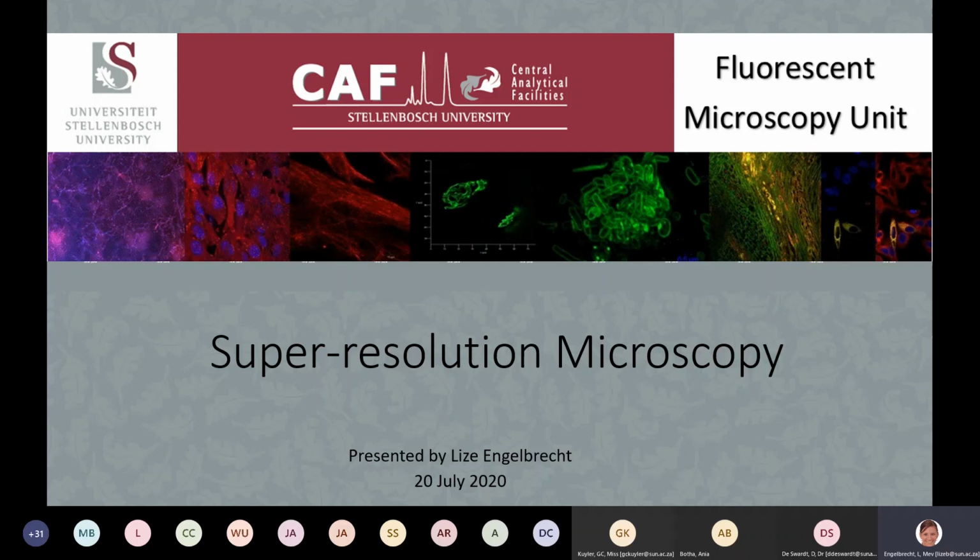But because of the limitations of an electron microscope, which can't see living things, we can't follow live events, we can't always determine what protein we are looking at. We can look at the virus, or we can look at the protein, and we can look at the organelle, but it's not always easy to see what it really is because it's full of information.